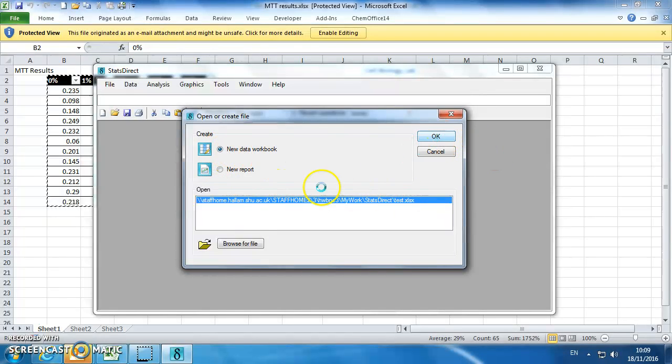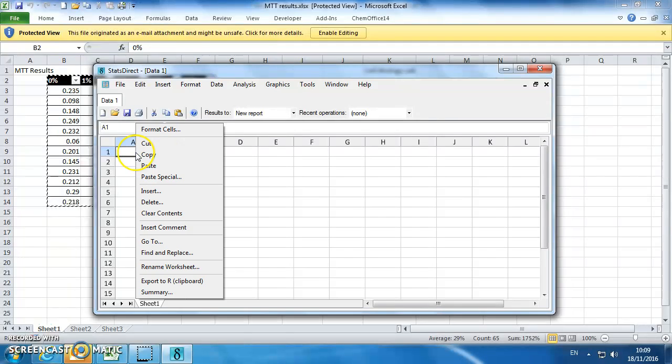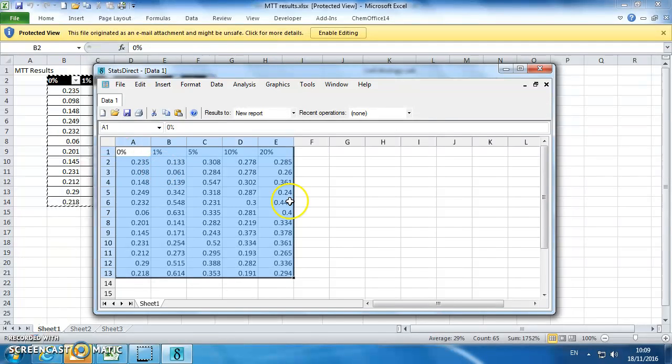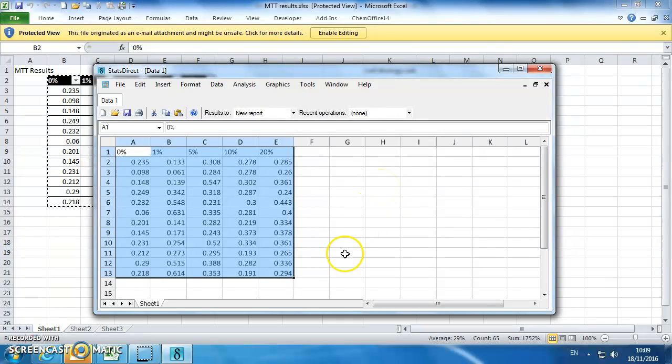New data workbook, and then just paste your data there. So this is MTT data, we're going to assume it's non-normal data, normally distributed, then we're going to do a Kruskal-Wallis on there.